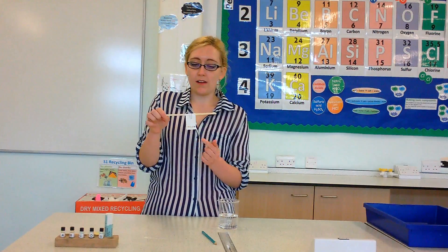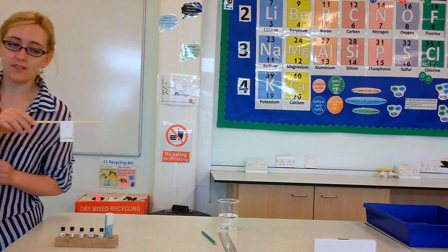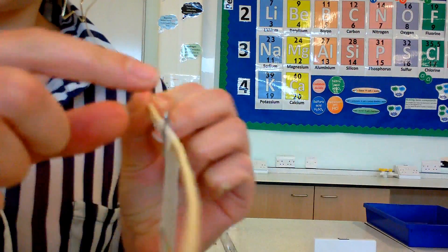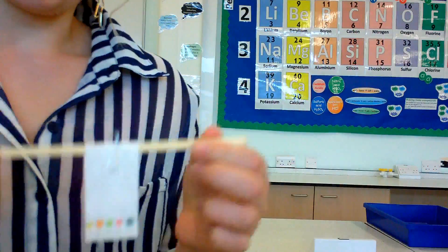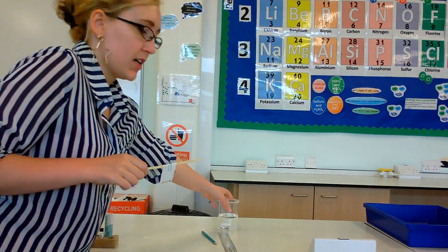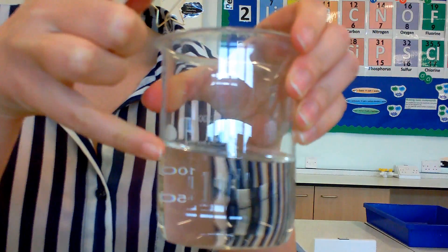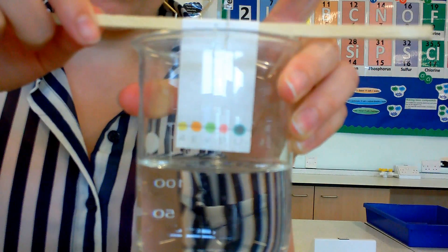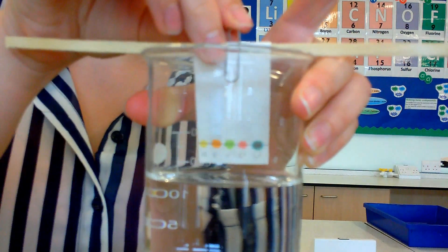Once you have your pencil line with your inks, you can see how I've attached it. I have folded my piece of paper over the splint and popped a paper clip in there to keep it steady. For your beaker of water, you'll want the level of the water so that when you put in your chromatography paper, the paper just hits the water.